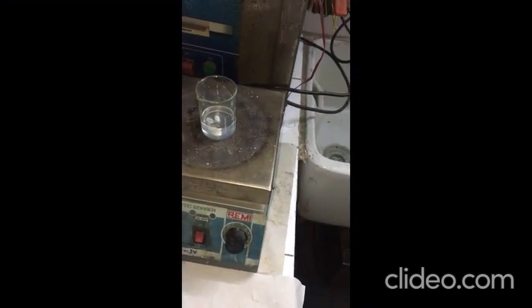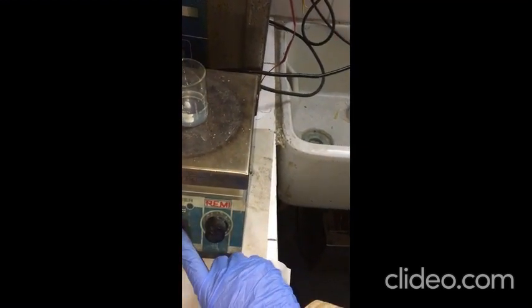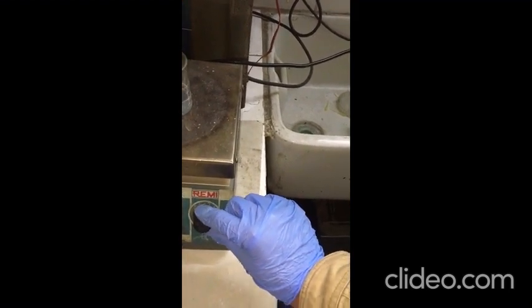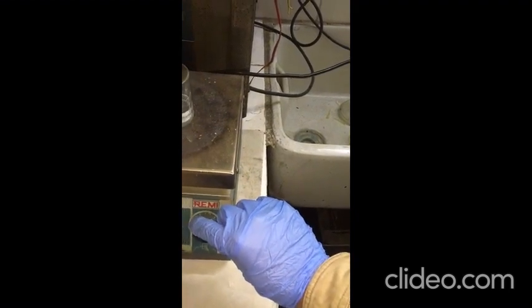I will show how the solution will be made. This is the switch on button. Switch it on. This is the rotation control. By this knob, we will change the rotation of the magnetic stir bar.